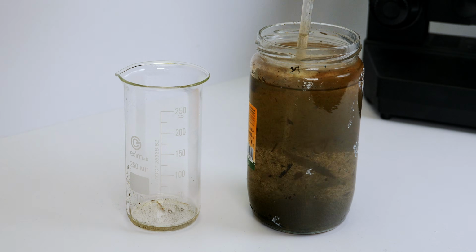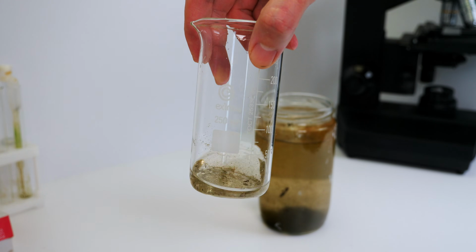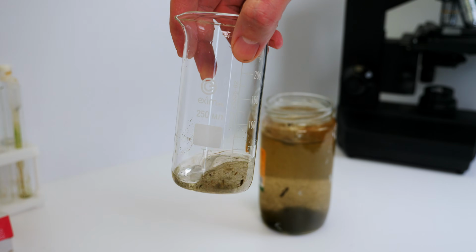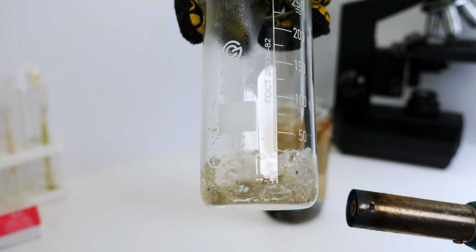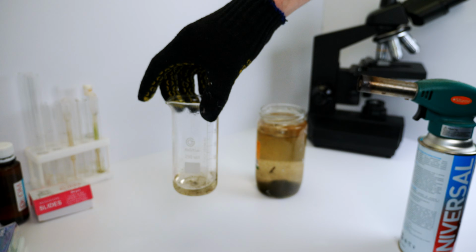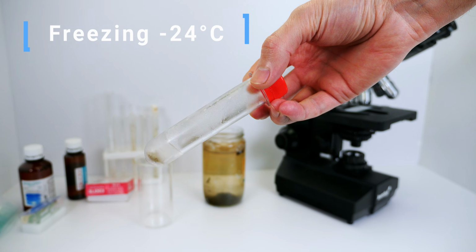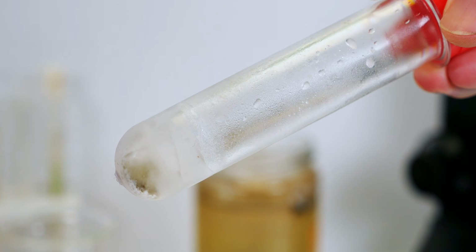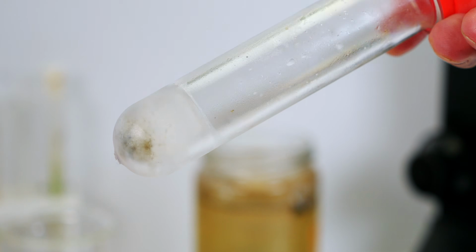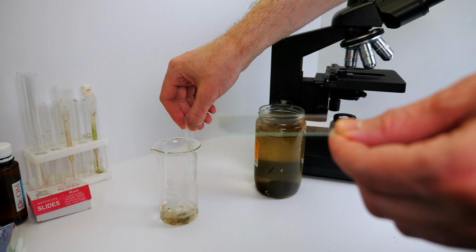The first thing that may come to mind is boiling this contaminated water. You already saw that it contains microorganisms, so let's actually boil it and check it under the microscope to see if anything survives. As soon as the water reaches a boil, we'll set it aside and let it cool down. By the way, what about winter? I specifically froze this same water with microorganisms inside, and today we'll also test frozen lake water that had microbes floating in it. But first, let's deal with boiling.